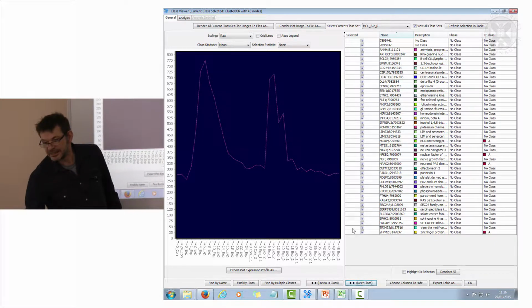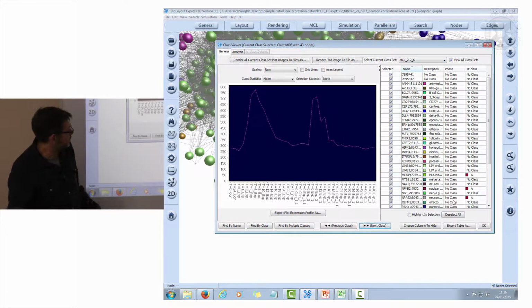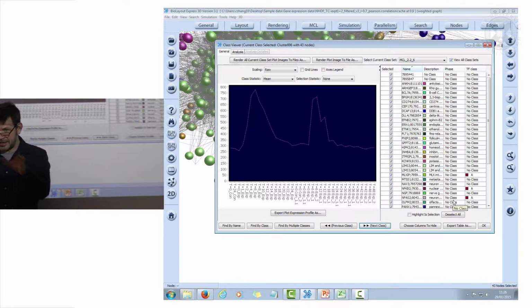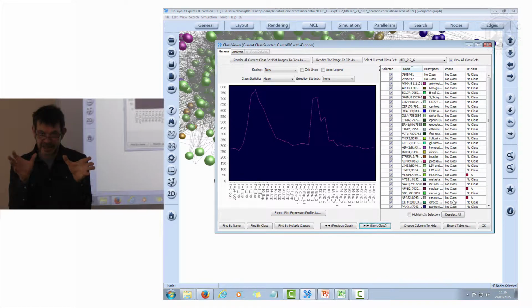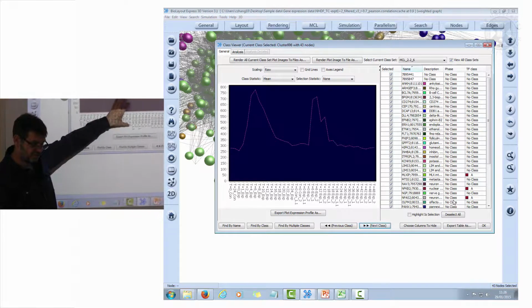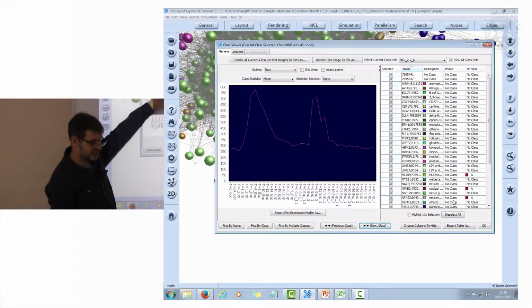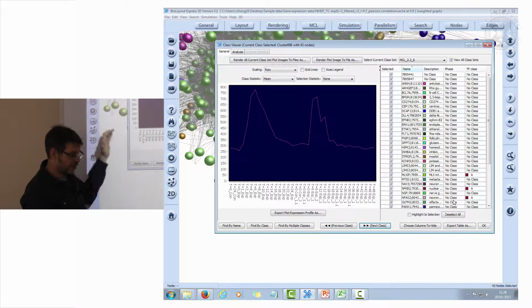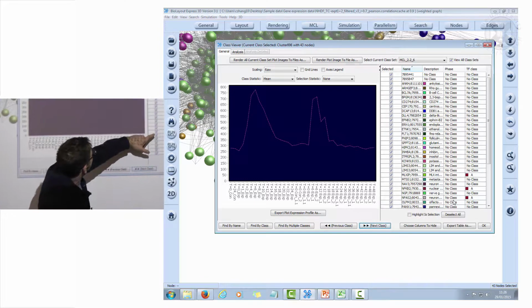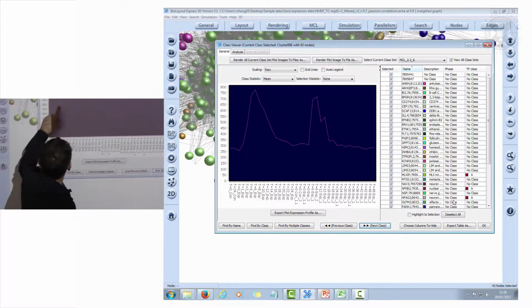Right, so now we're getting to a lot smaller list. When you select a bunch of nodes, it'll say how many nodes are selected here. The real way that it's better to work with BioLayout is to have two screens, one of which shows you the graph, the other one which shows you this. This way you can keep a visual record between what you see in terms of the profiles and where they are within the graph. But you can see these guys here. A lot of them are essentially not up, or quite up, early on.